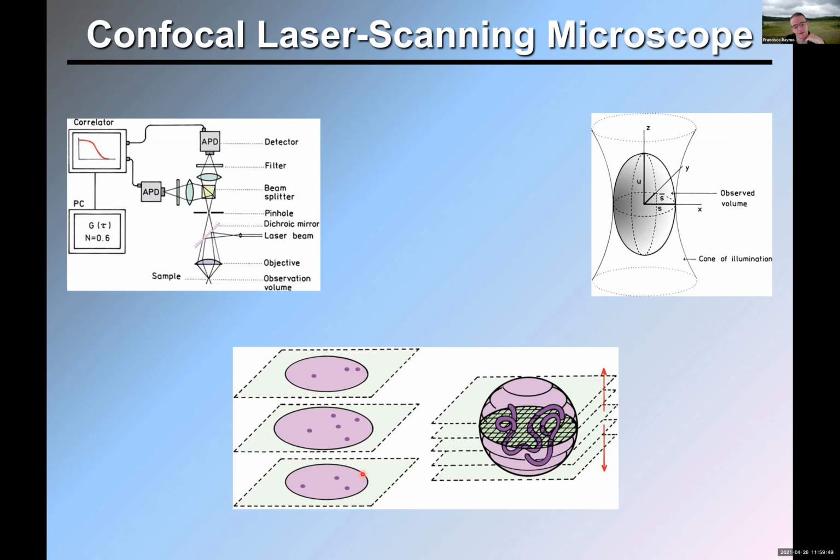Later, I will show you one example from my lab, and I will show you how it is possible to acquire, by scanning the focal plane vertically, images that are at 90 degrees compared to the focal plane. I will show it to you in a moment.